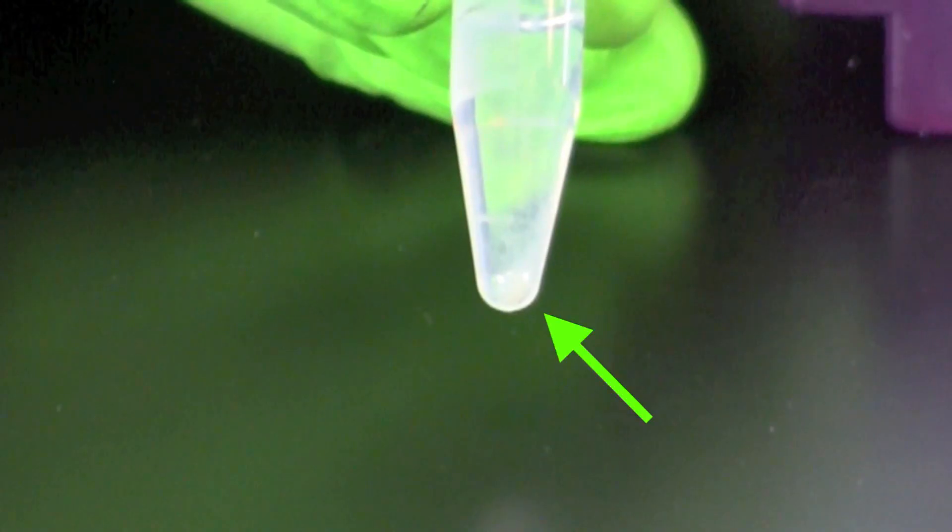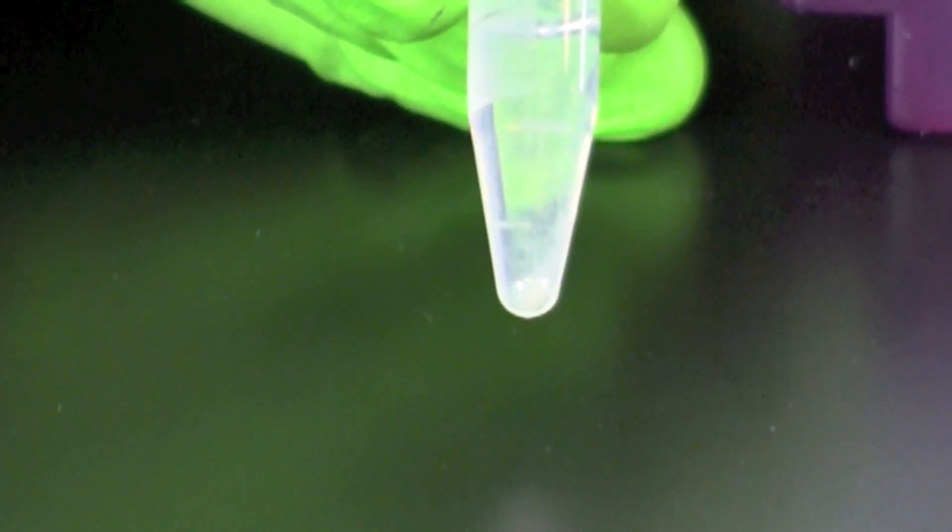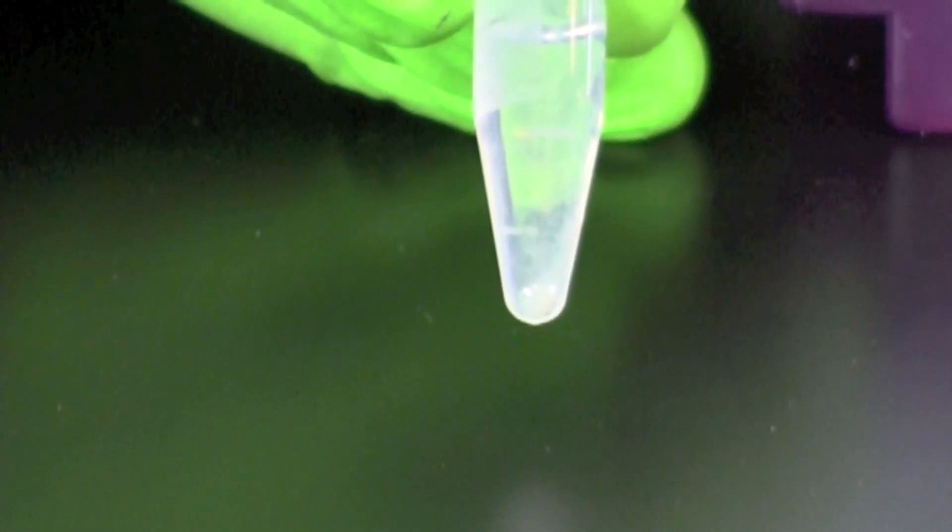If the pellet is smaller than a match head, remove the supernatant, add another 1 milliliter of mouth rinse to the same tube, and repeat the centrifugation.